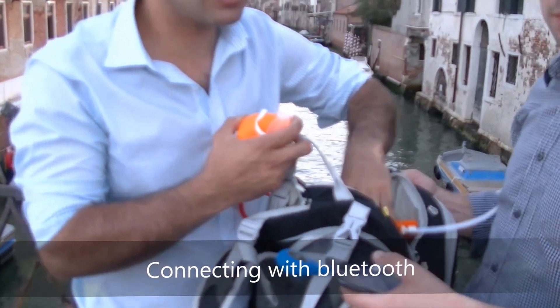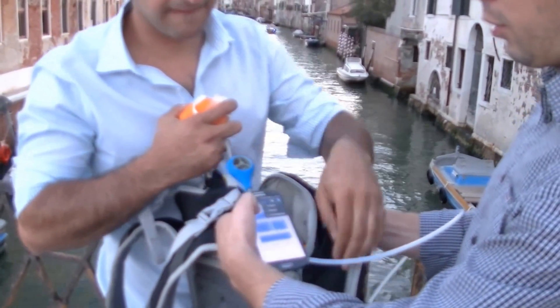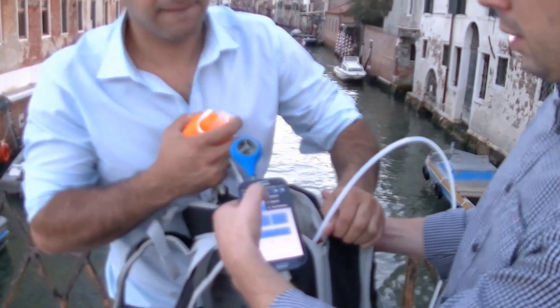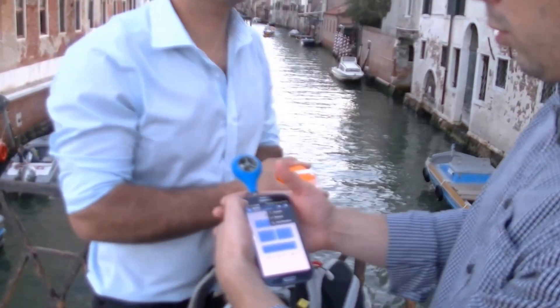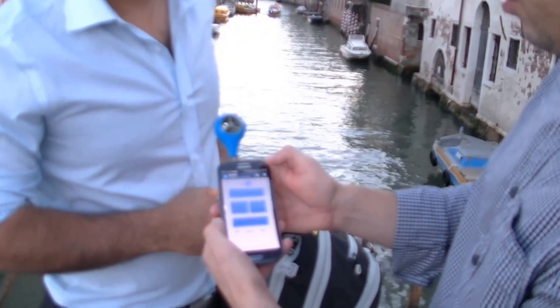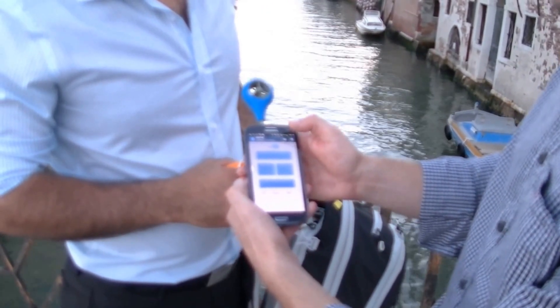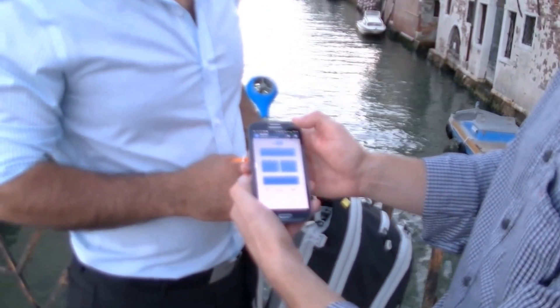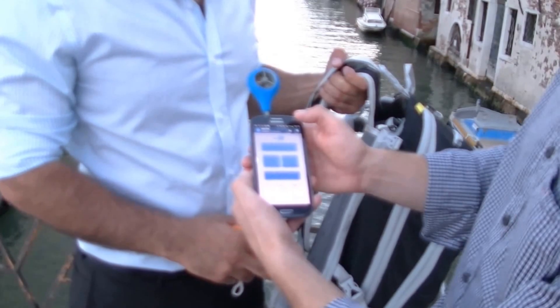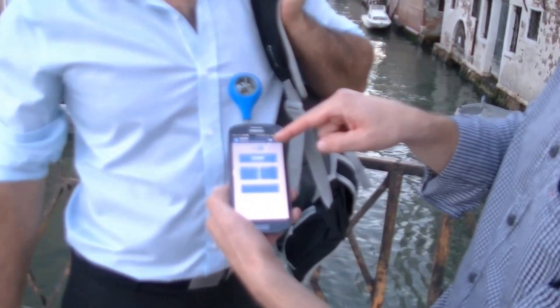Let me show you — if you zoom in, you can connect to the SM100i with Bluetooth from your cell phone. Just click connect, choose a device, wait a second, and in the action bar you can see it's connected to the device.